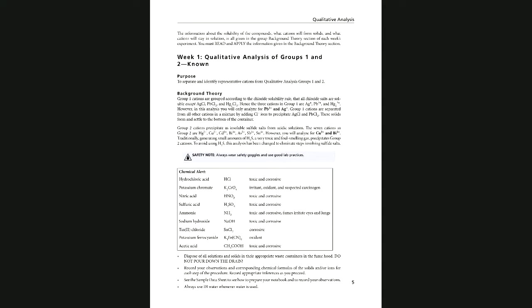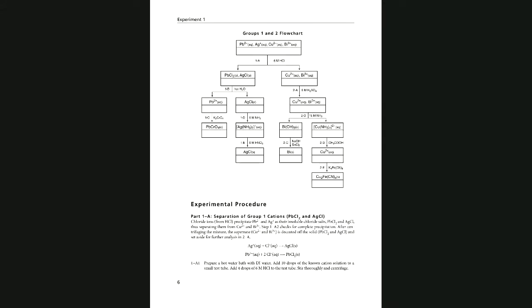So the background theory also is explained in detail, and your professor could also hold a session on Blackboard Collaborate, and if they want to explain more about it, it will be explained during the lecture or pre-lab discussions for you. So we have time to finish the actual experiment and not to run the experiment, so you could record your observation properly and in time.